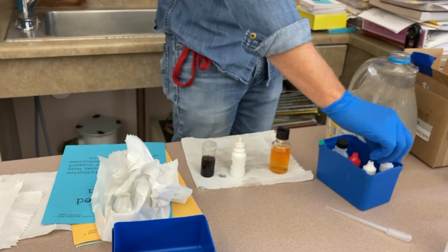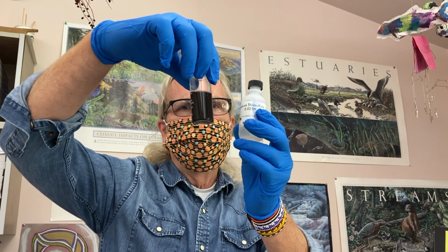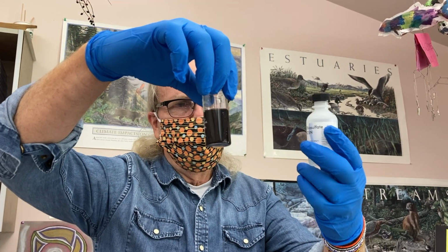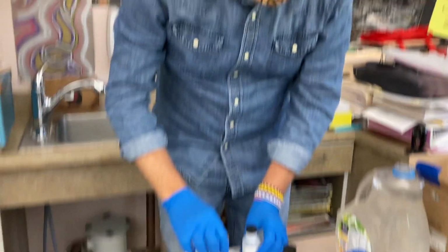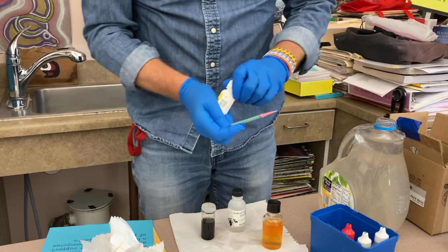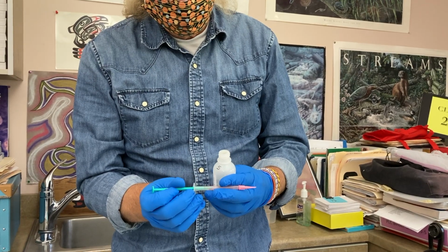Now we get the sodium thiosulfate, which is again going to be dropped in drop by drop, well, close to it. And what will happen is when this turns completely colorless again, like water, then we'll have counted how many parts per million, or milligrams per liter, of oxygen are in the water. So that requires a syringe. There's no needle here. It's just an empty syringe.